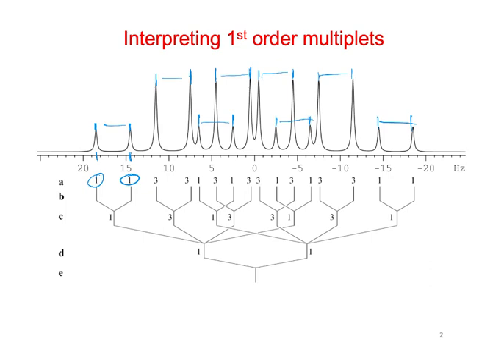Okay? So the next thing we could look at then, we could go back and collapse each of those, right? So we'd bring those two together to here, to here, to here, and they're all collapsing back to this point. The next thing we might look at is that the size of these two here is roughly a 1-to-3 ratio to the next biggest peak.